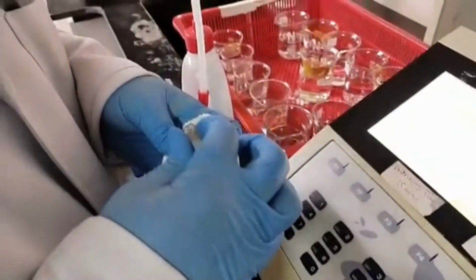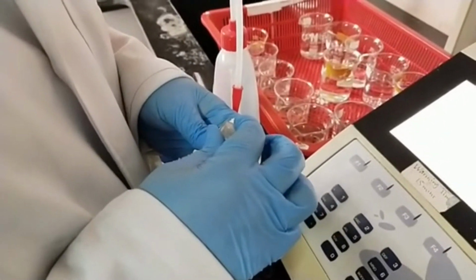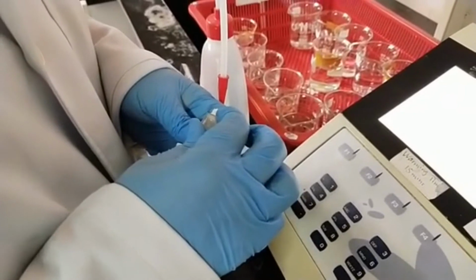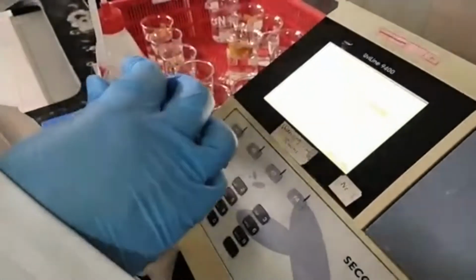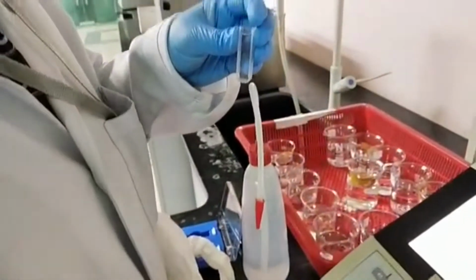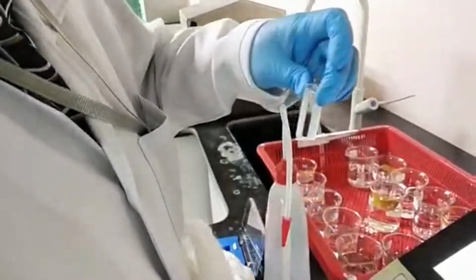Okay, so I'm going to show you how to operate this UV spectral. So we are going to use spectrum today. Okay, press enter, and then for pH we have done the preliminary setup where we're going to scan the wavelength from 200 nanometer, 210, 220, 230 until 280. So this is actually the buffer without furosemide mixture. Okay, so this is pH 2.